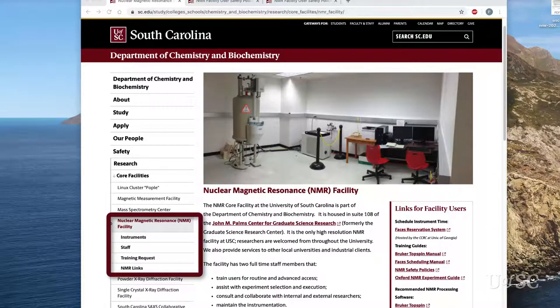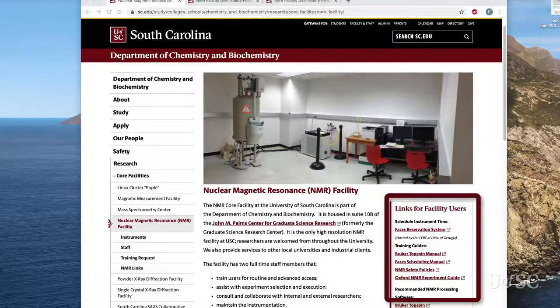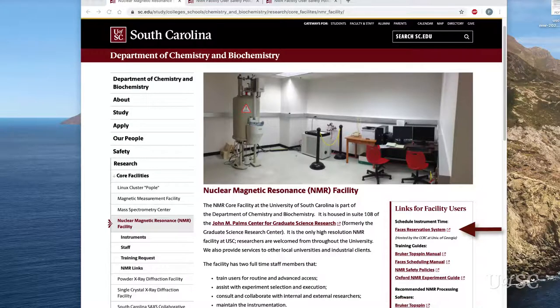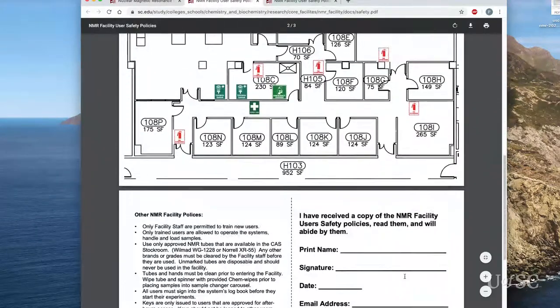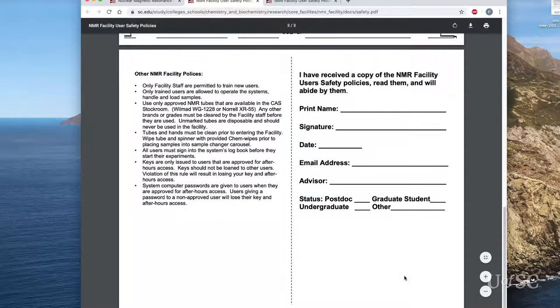The left column on the facilities web page contains links for information about the instruments, contact information for the staff, and the training request form. In the right-hand column there are important links for users. At the top is a link to the online scheduling system called FACES — we will go into details in a separate video. There is also a link to download our Bruker TopSpin manual that covers in more detail the information in these videos. Please download and read this short manual before your training session. Finally, there is a link for the NMR facility's safety policies.